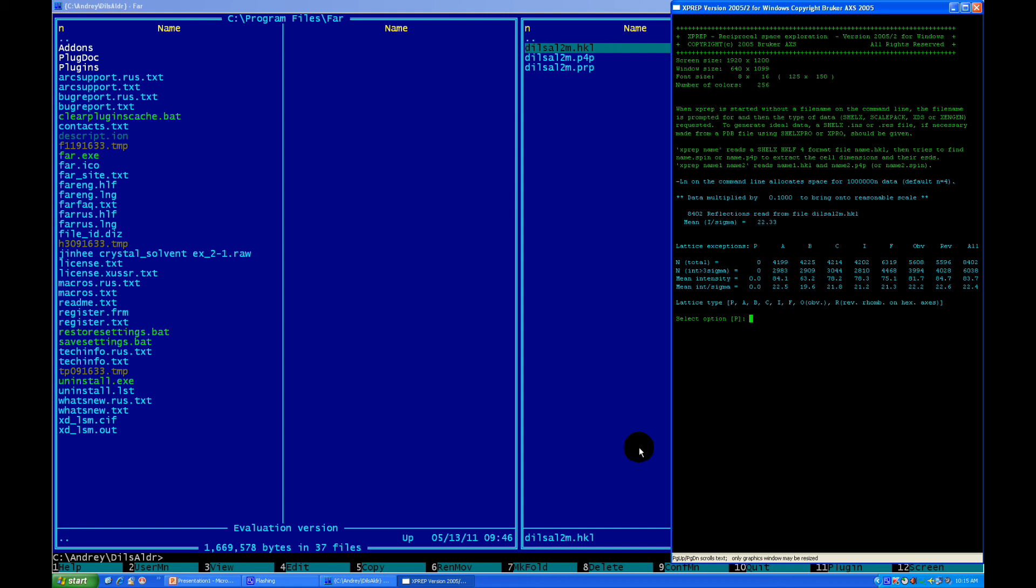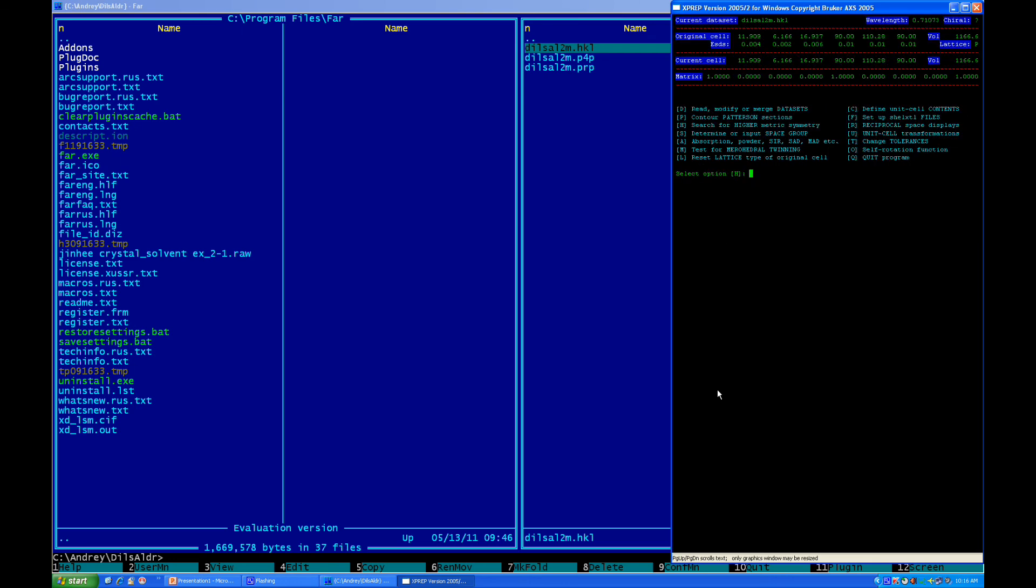First thing what xprep determining is, it's determining the lattice. What type of lattice do you have? Obviously, in this case, we have a p-lattice. Another thing, you can see here, the p is in the brackets. Those brackets mean, if you press enter, program will select this choice. For example, if I know it's a p, I don't need to type a p. I just need to press enter, and the computer will automatically understand what it's p. Let's press enter.